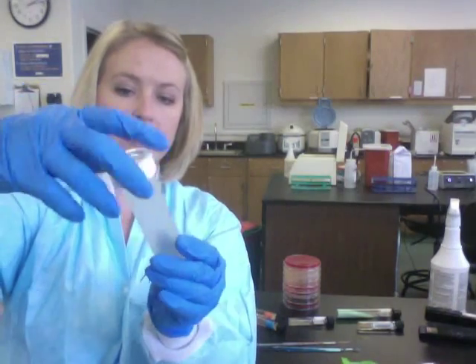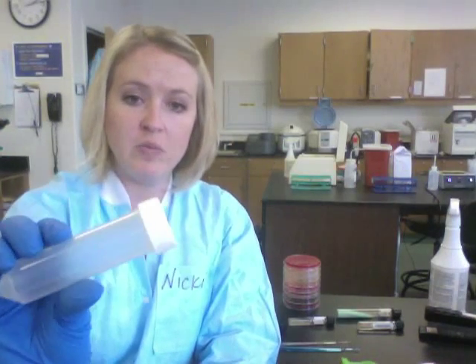When you're done with that, take your cap that has been kept sterile and screw it on tightly. Once again, make sure this is labeled with patient information, and you are done setting up your tissue culture.